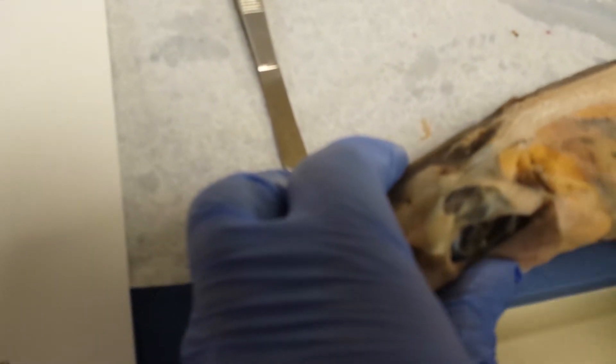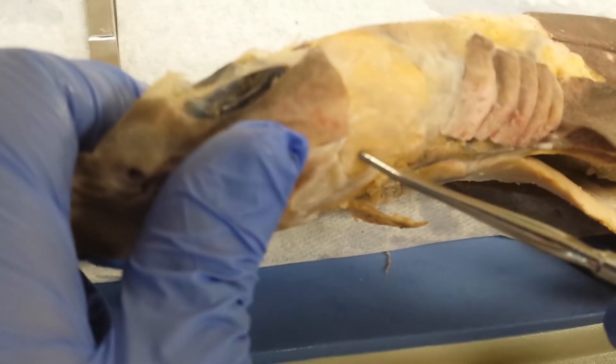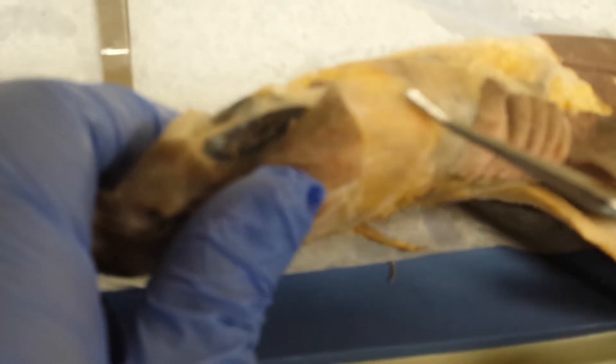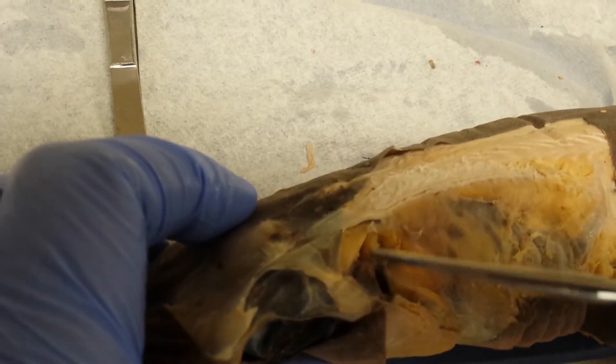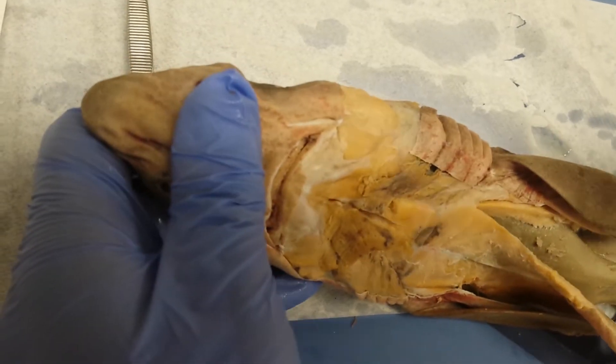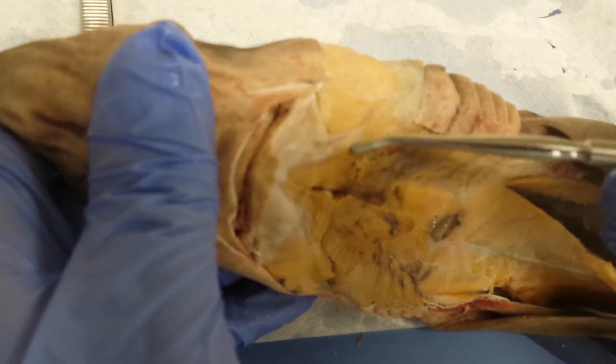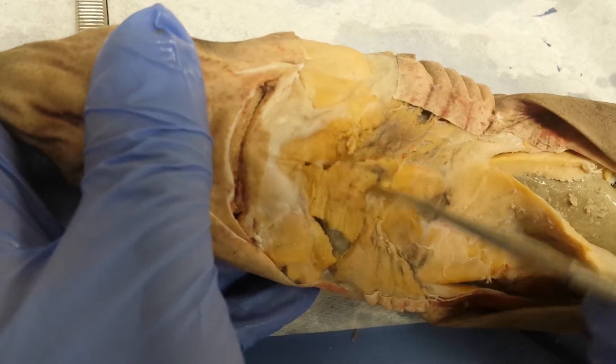We're done with the dorsal ones, and here's one that you can see both in the dorsal view and also the ventral view. This is your adductor mandibuli. The adductor mandibuli with the spiracular makes your first gill constrictor. Now you can see a complete ventral view of that muscle. You're going to see the first gill constrictor here, and you can see it on this side as well.